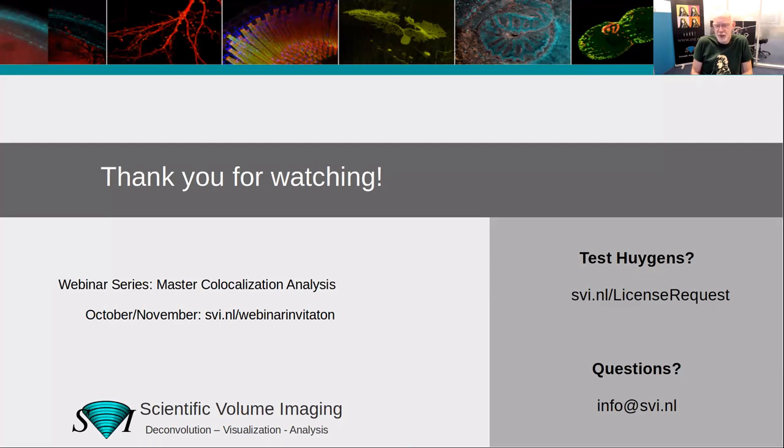And we want to conserve that metadata, so we need to be able to do that. The community is not that far yet doing that. We are in communication with them. And that's why we decided to take a leap and develop this format. And that is as open as it can be at this moment.